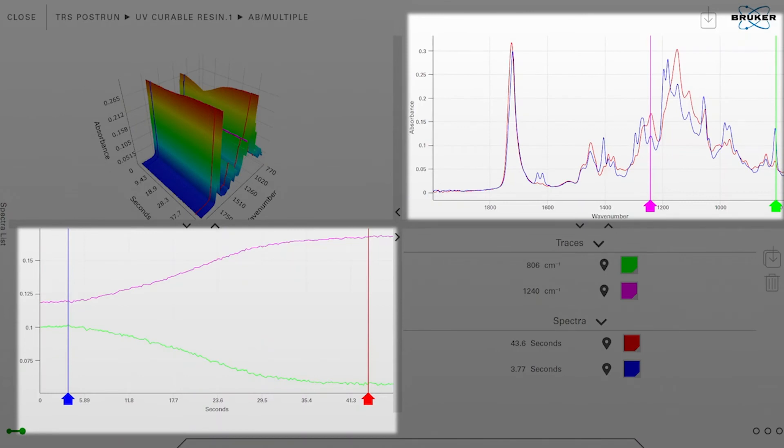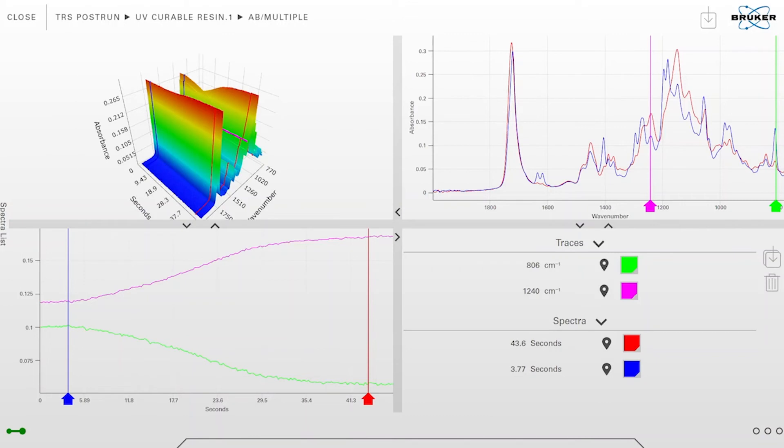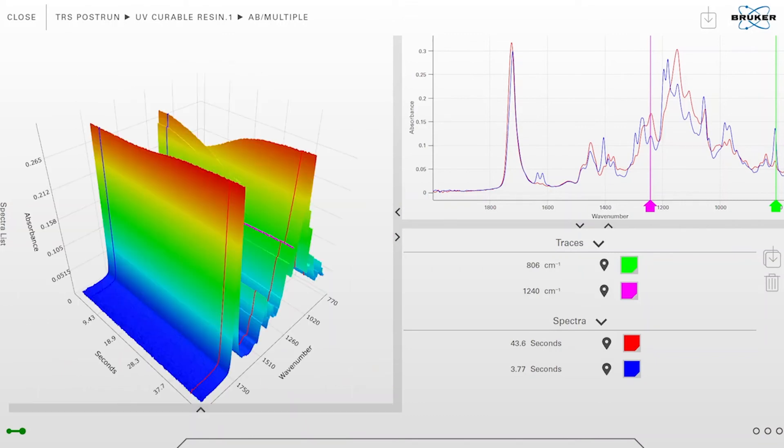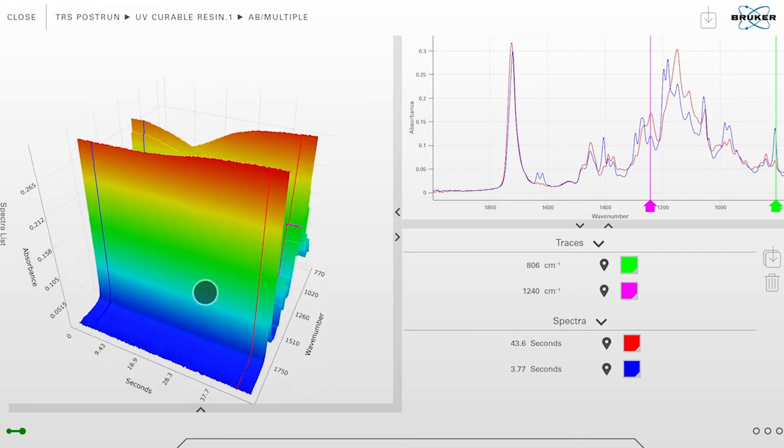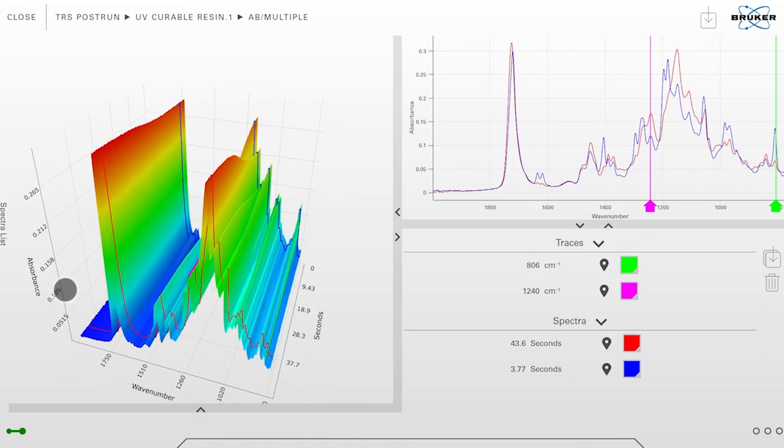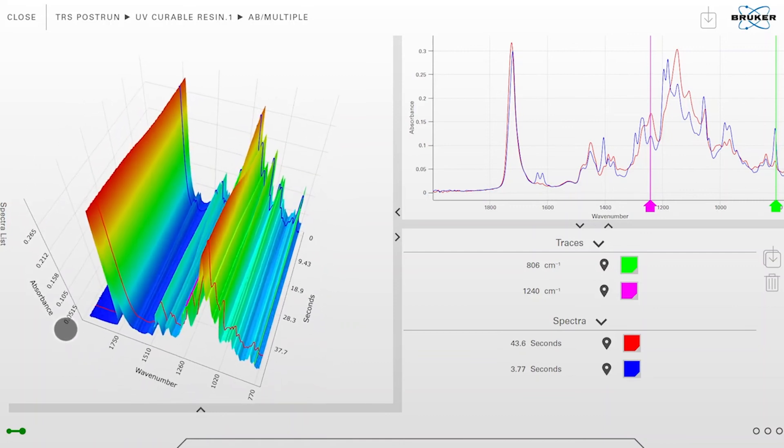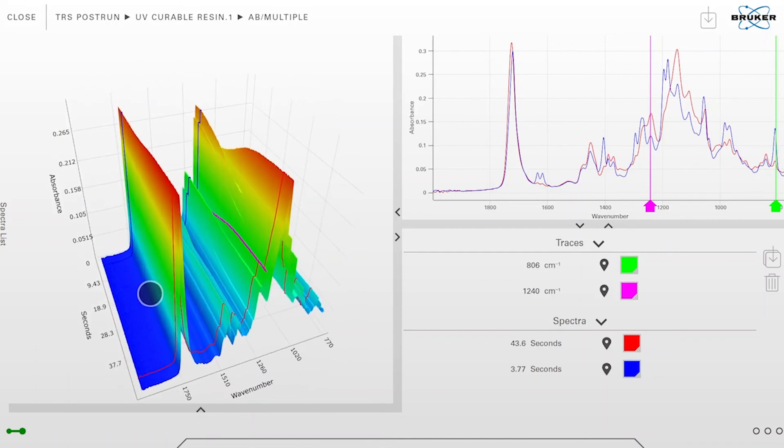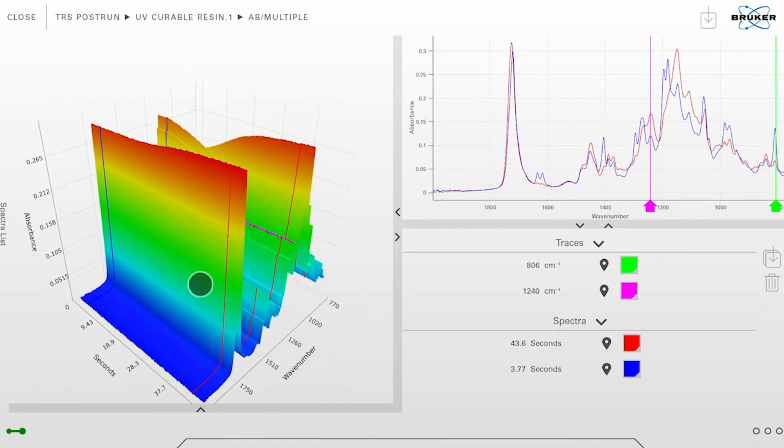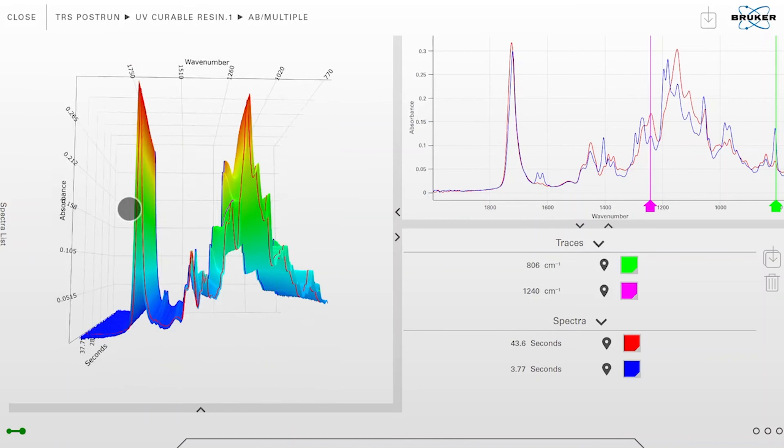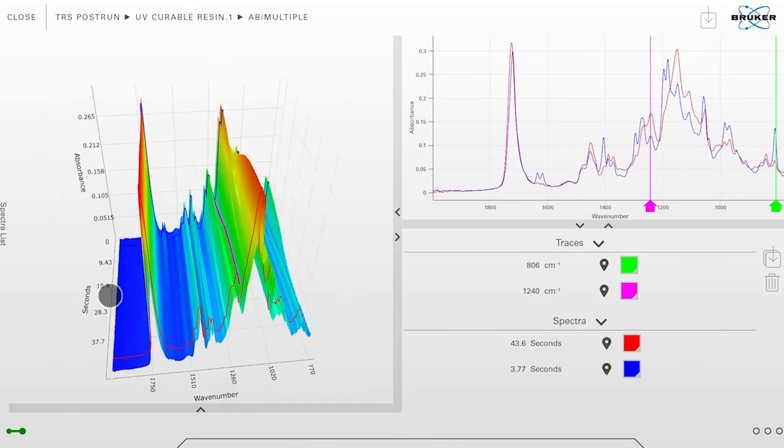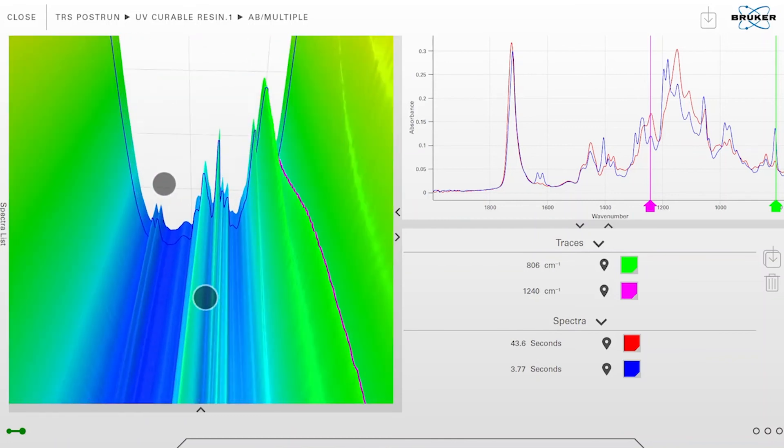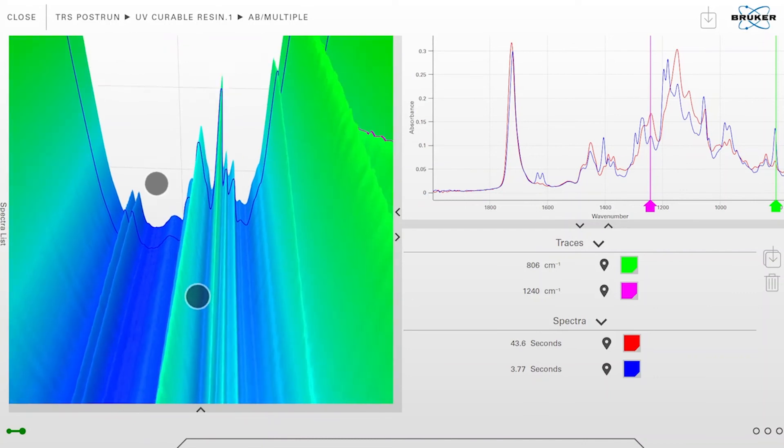It's also possible to expand one of these four views. For example, the 3D view can be expanded. Now we can move this 3D view around to get the perfect angle to visualize our data. I can use a one finger gesture to move, tilt and turn it, or I can use two fingers to zoom in and zoom out.